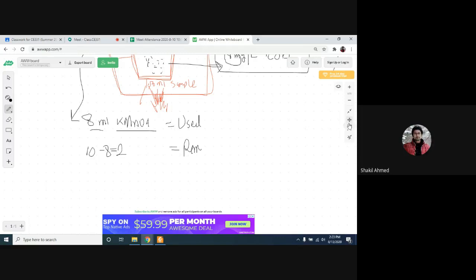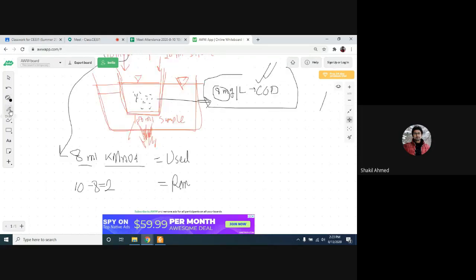Yes. So do you have COD now? Right now you do not have COD, because the 8 ml of potassium permanganate has already oxidized this COD. What do you have? You have the remaining 2 ml potassium permanganate. Clear? What do you have in this solution now? Only 2 ml potassium permanganate. You do not have COD.